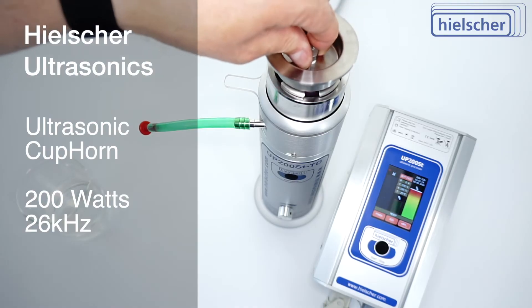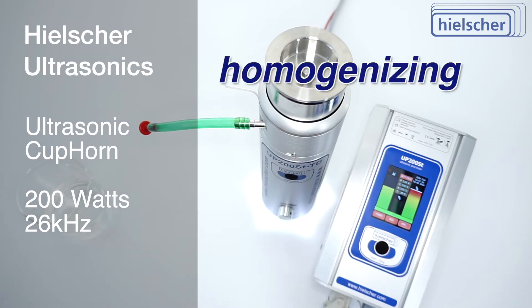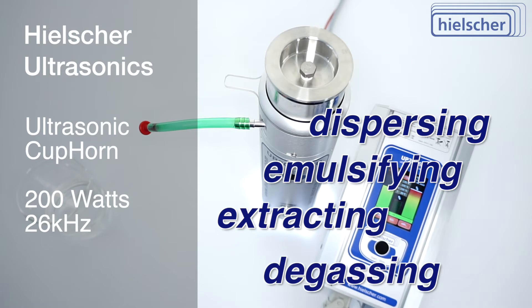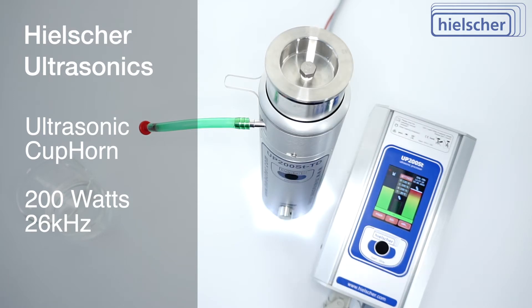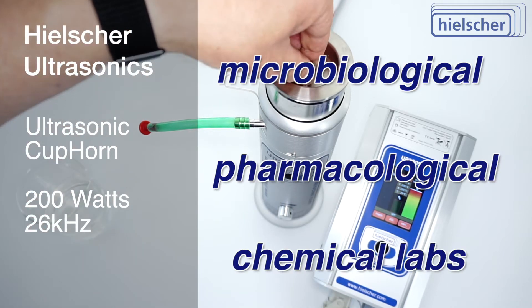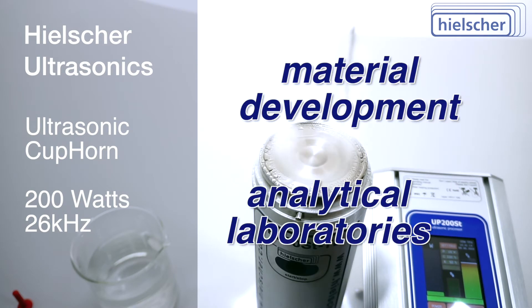With this high ultrasonic intensity, the Hielscher Cup Horn is ideally suited for homogenizing, dispersing, emulsifying, extracting, or degassing of laboratory samples. This makes the Hielscher Cup Horn an essential tool, for example, in microbiological, pharmacological, and chemical laboratories, in material development, or in analytical laboratories.